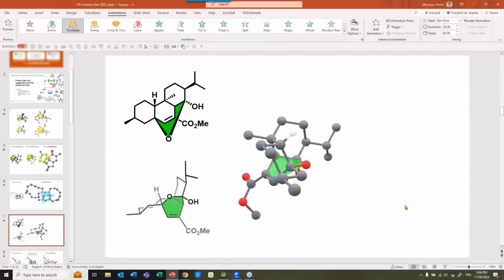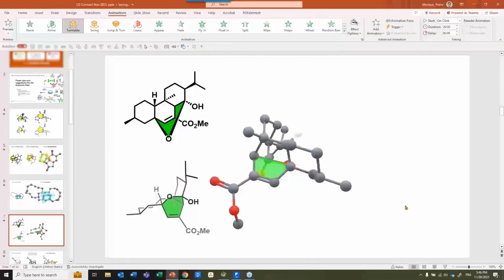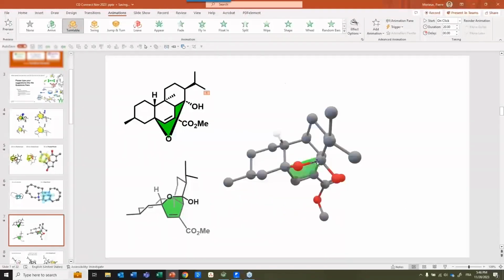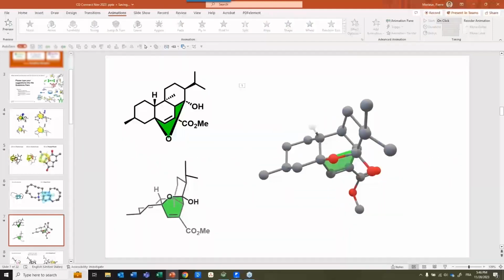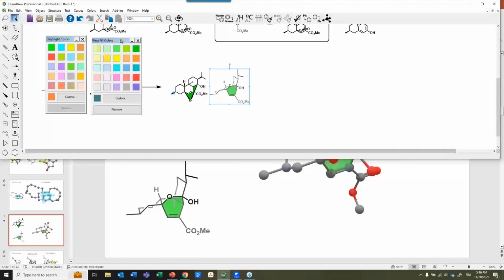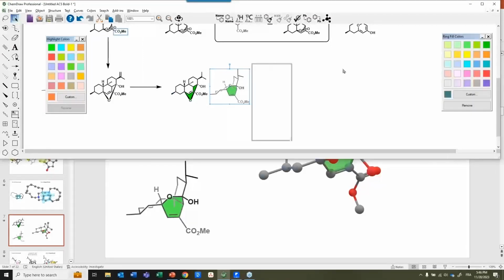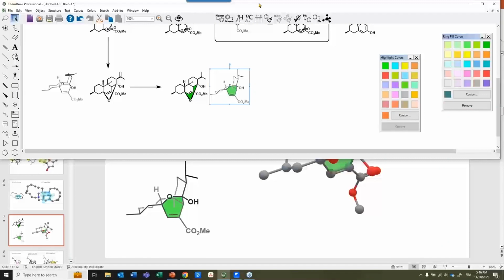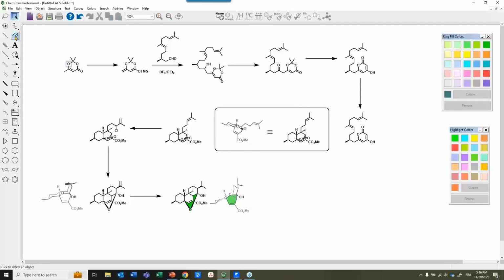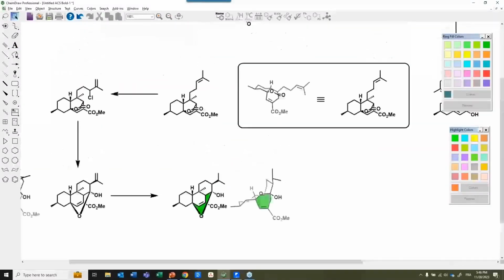All right, so I took a little bit longer than anticipated, a little hiccup, but I wanted to really show you step by step how you can do, obviously you can do it faster once you get a hang of it, how to easily represent a multi-step total synthesis with mostly the keyboard on your computer. The one thing that didn't show was really how to insert all the reaction conditions every time.